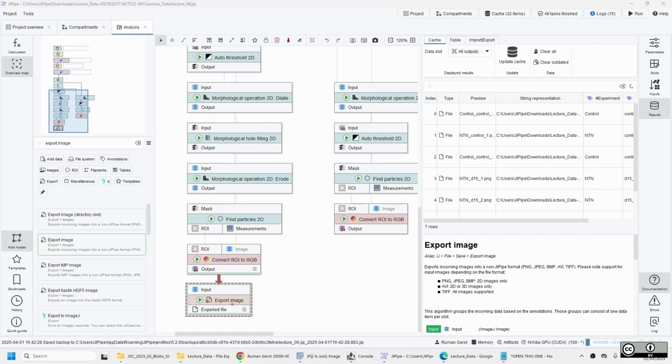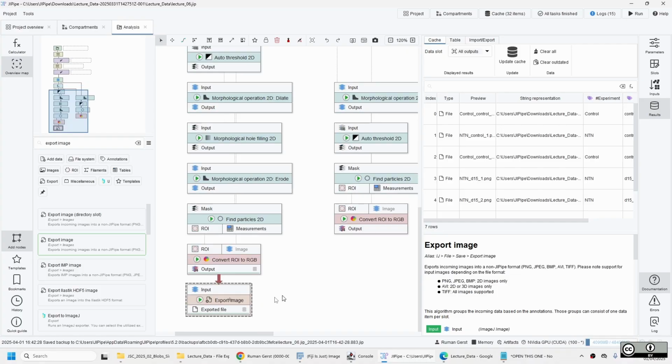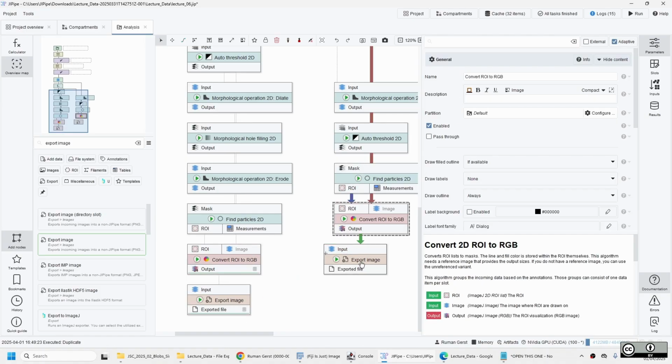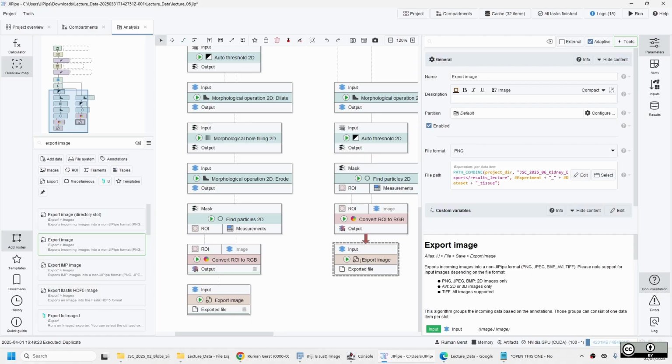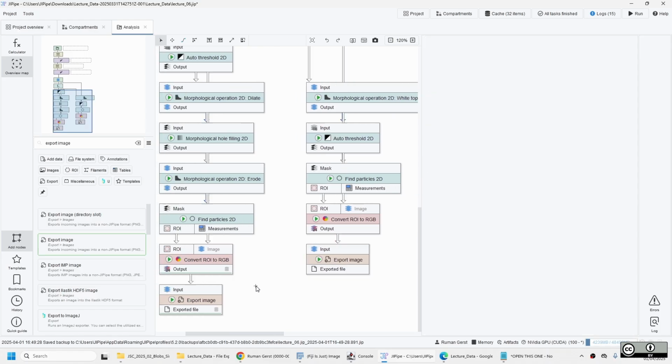Now we have a template. We can do the same thing to the other one. Okay, and maybe here we have the tissue. We should make a good name for it. So let's do this. Maybe put an underscore under it, like underscore tissue or something. So you can come up with any name you want. So I'm doing the same with the glomeruli. So we have them also out. Glomeruli. And then I want glomeruli and table measurements also out.